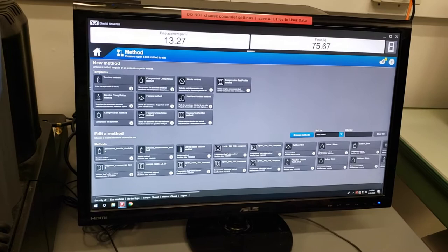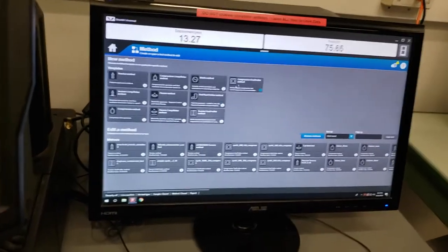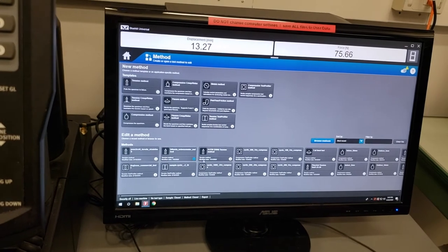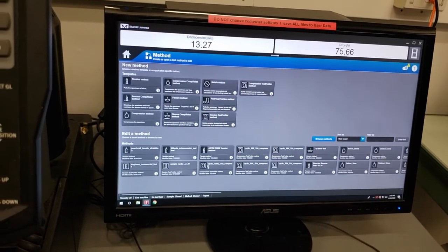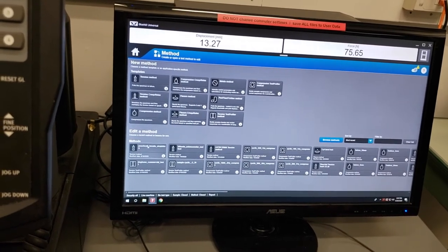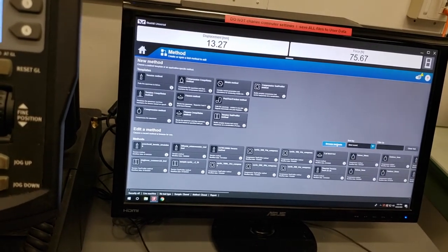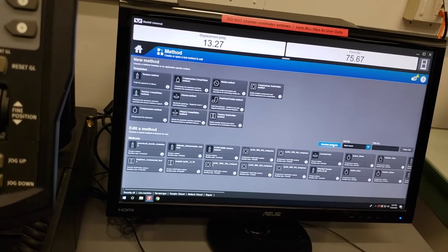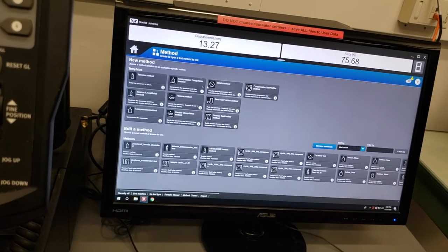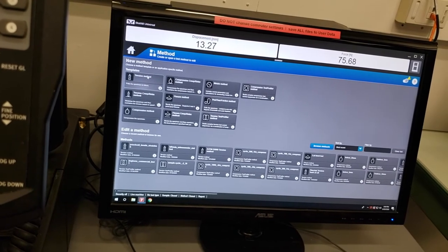This screen is separated into two parts. The first is new method — templates for normal methods we typically use. At the bottom you can see methods that have been created recently by other clients. If you have recently made a method, you can find it down here or click browse methods to make changes or look at the parameters within your method. If starting from scratch, come up here to new method.